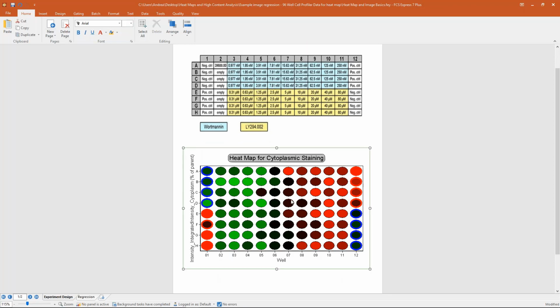So what I've done here was first opening my heatmap and creating some gates. This is a multi-well gate. You see the blue gate, which is the negative. It's actually including 8 wells, this one and these ones. And then you have a positive gate, so 4 and another 4 here.